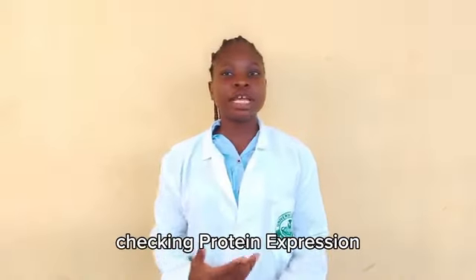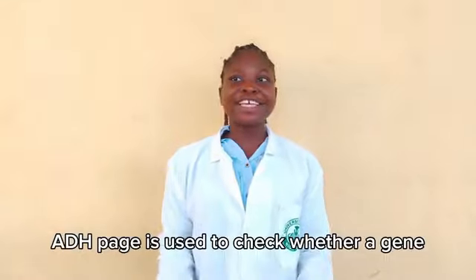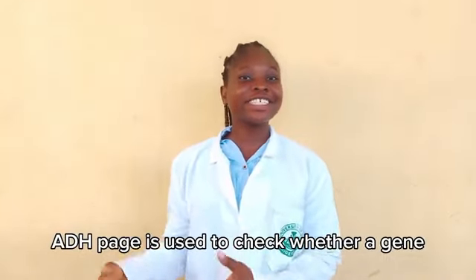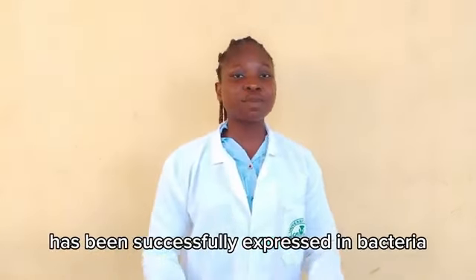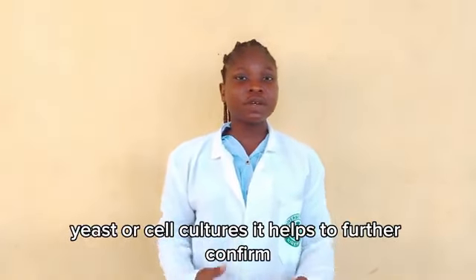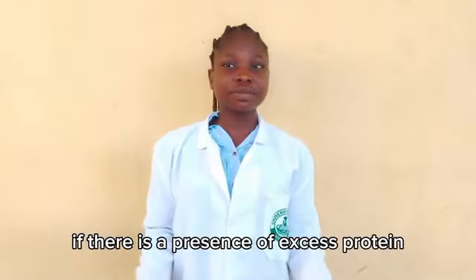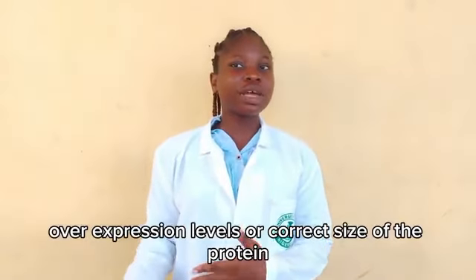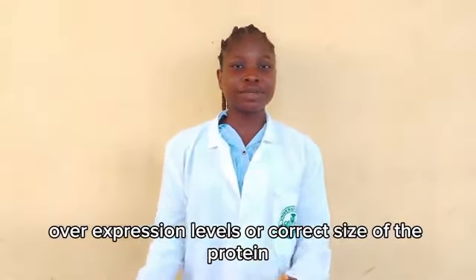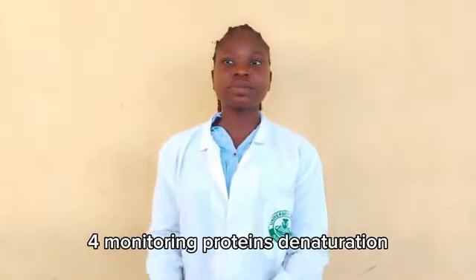3. Checking protein expression. In biotechnology and research, SDS-PAGE is used to check whether a gene has been successfully expressed in bacteria, yeast, or cell cultures. It helps to further confirm the presence of excess protein, overexpression levels, or the correct size of the protein. 4. Monitoring protein denaturation.